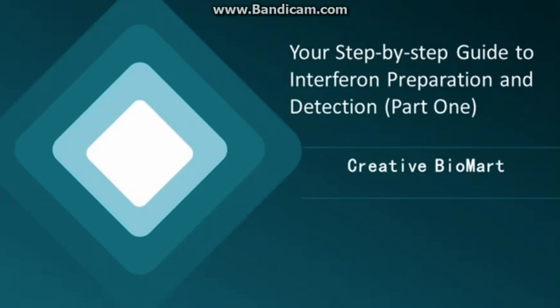Interferon Preparation and Detection, Part 1.